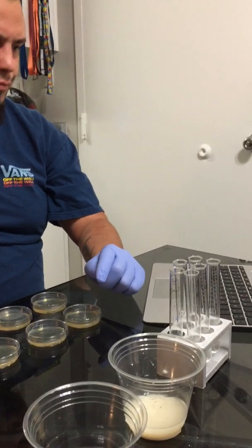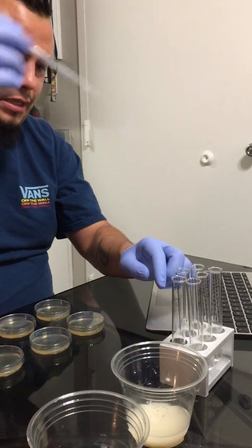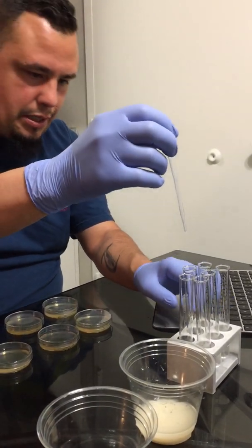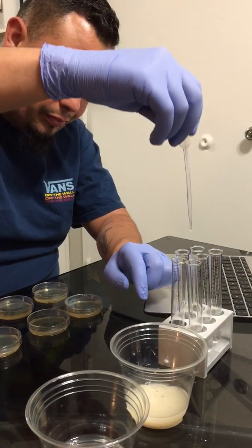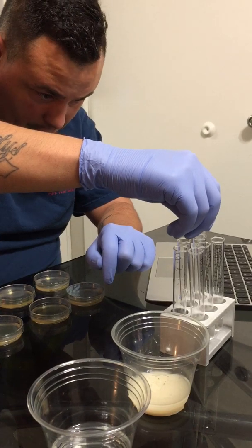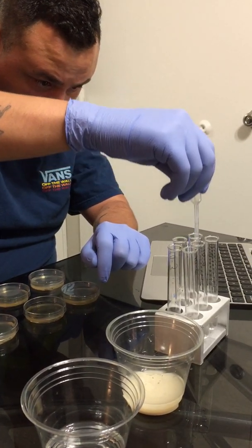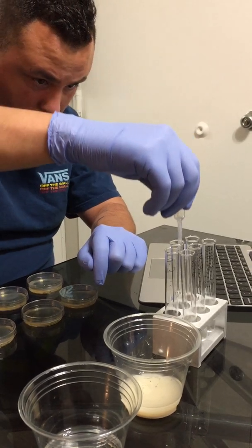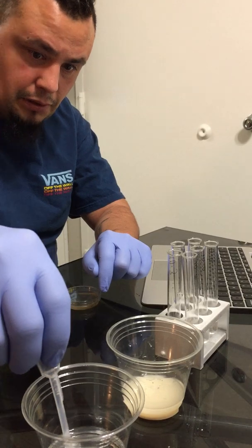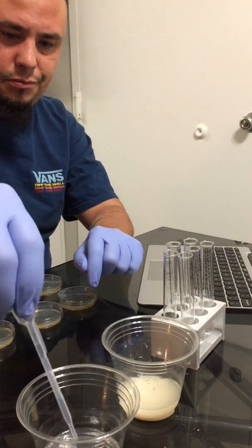Now what we're going to do is dilute it. So we're going to go back into that same one. We're going to take the same 0.25 and go into the second tube. Alright, so that was into tube number 2.